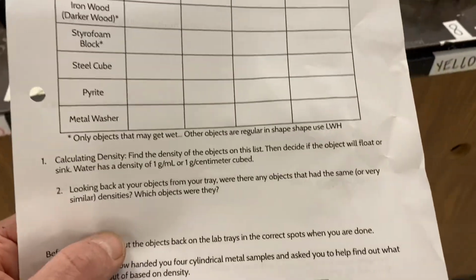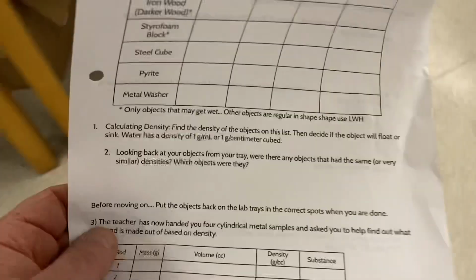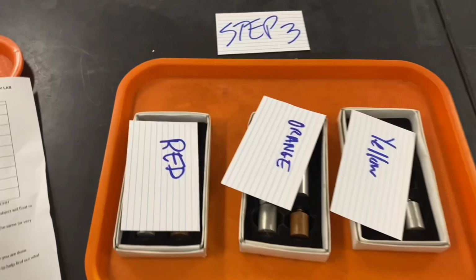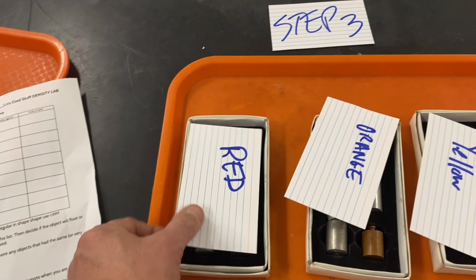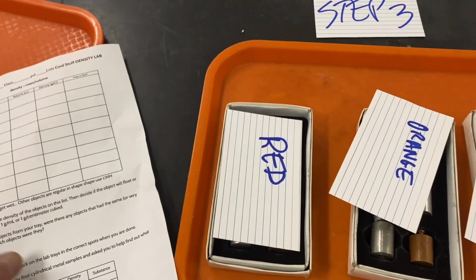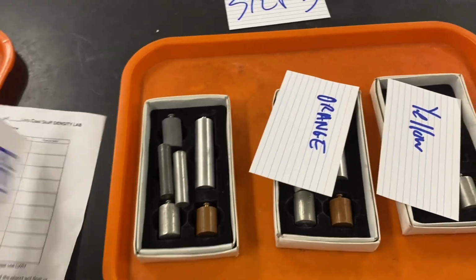A little question or two, and then you're ready for part 3. Once you answer the question, don't start part 3 until you're done with part 1. Part 3 involves getting a box of cylinders. Each table will have one box to use. So inside the box, you're going to see some cylinders. Your job is to find the density of 4 of them.